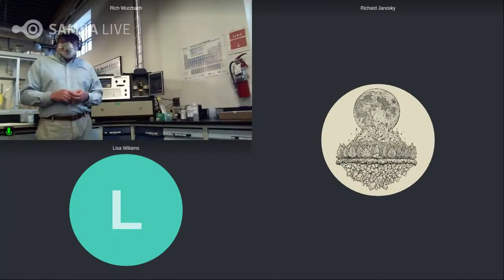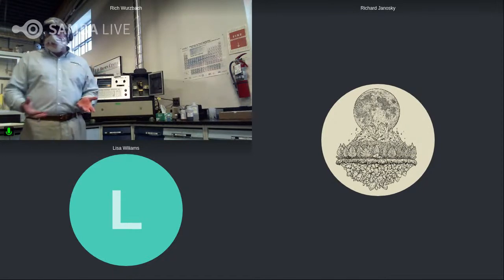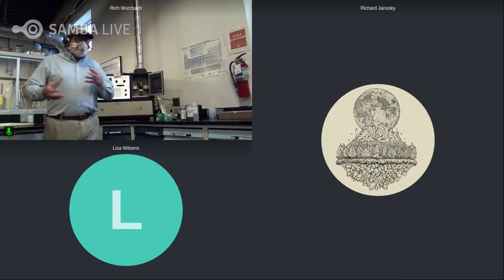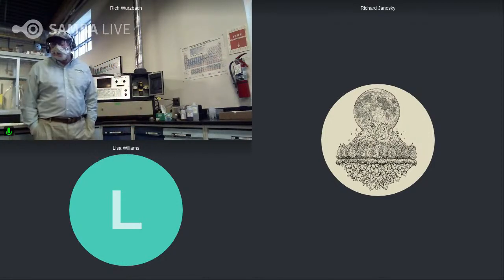And we have to think through the implications of it, which is, now that we have that solvent, what do we need to do? Maybe we need to filter the particles out so we get away from that solvent, because it can have a lot of implications for other tests down the line.